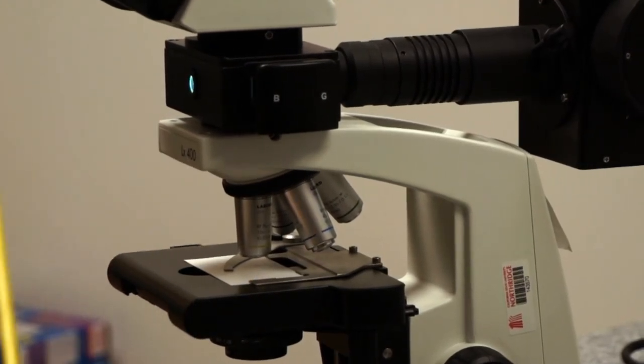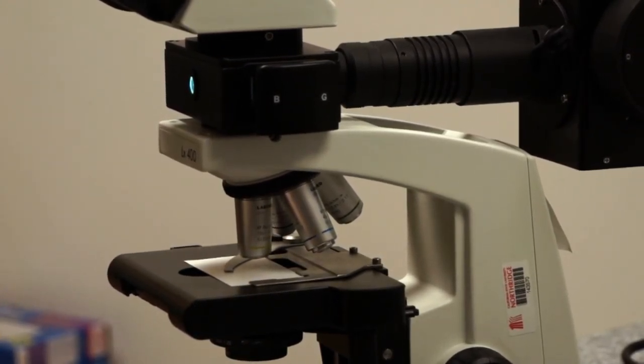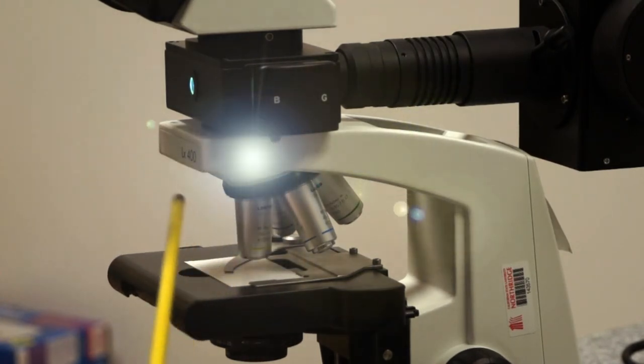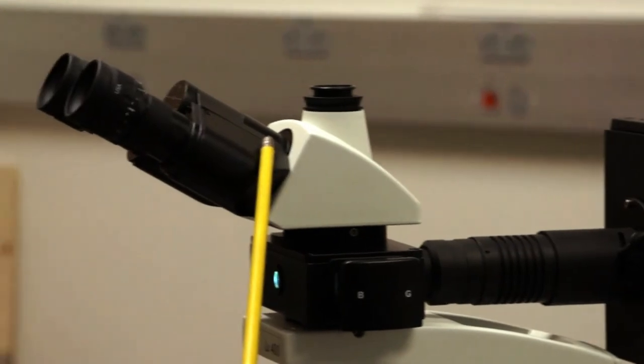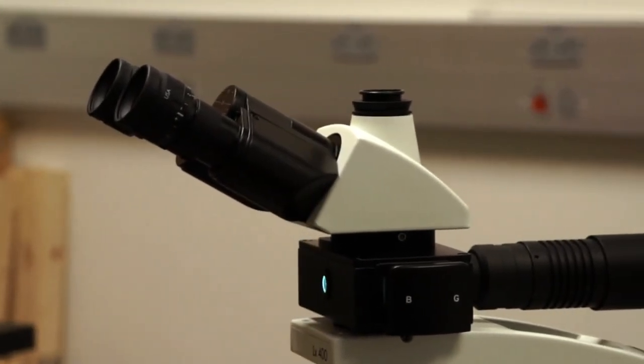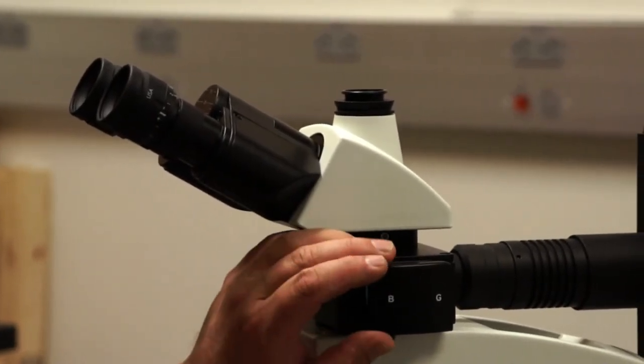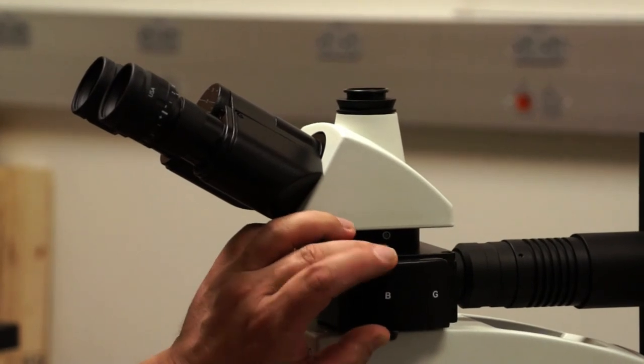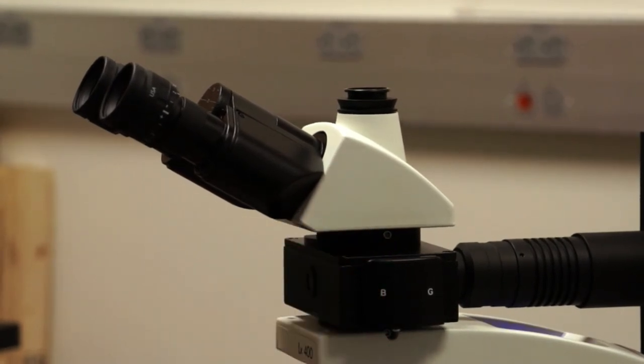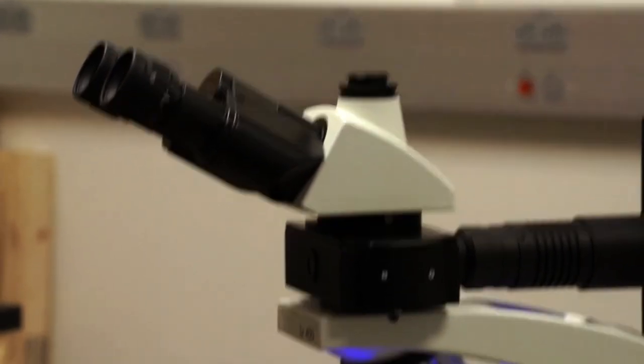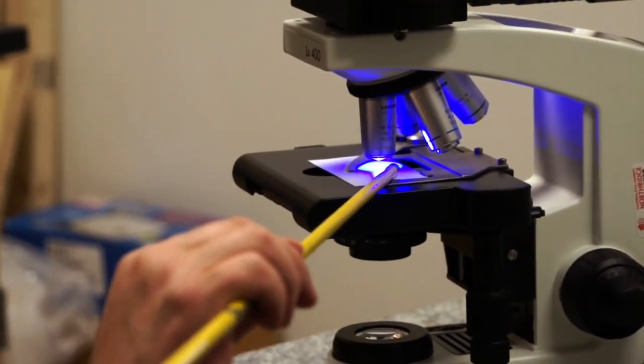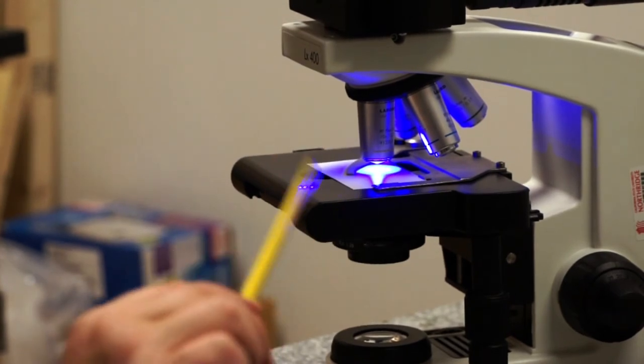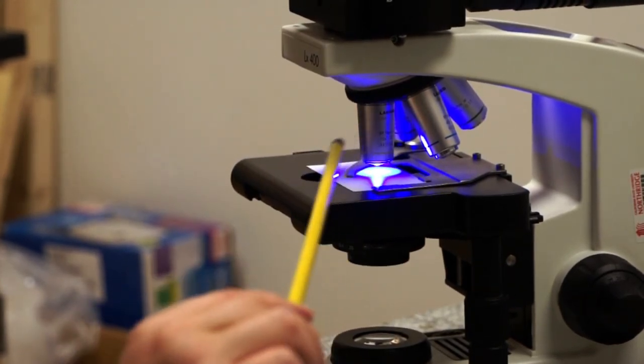Then it hits a mirror and is reflected downward to the specimen. So this is reflected light hitting our specimen. Then the light that is emitted from our specimen travels back through the objective, through the mirror, which passes it to the binocular or trinocular head. So if I push a set of filters into the light path, you'll see the bright blue light. What is this light? This is about 490 nanometers of light that is being used to excite our specimen.